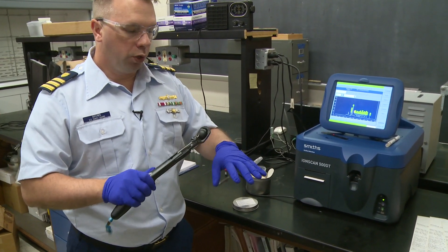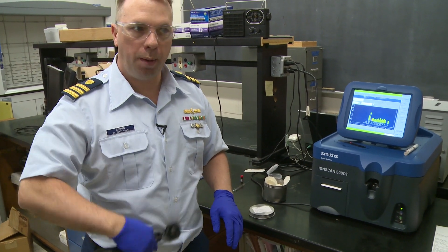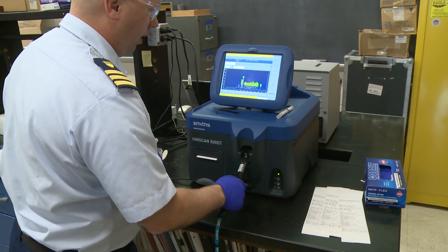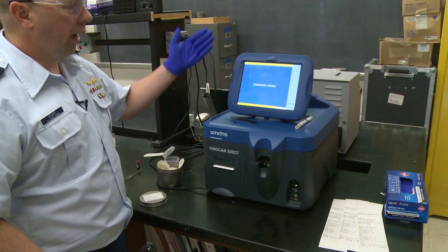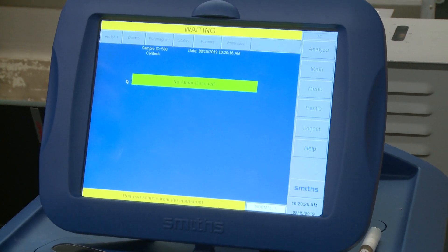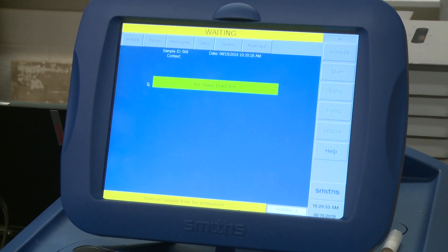When you first go, to prove that I'm not contaminating the instrument, I would swab myself to make sure that I'm not going to pop positive on anything. Is this a clean swab? As soon as you put it in, it automatically analyzes the sample for you. It'll tell you that no alarm was detected, so there was nothing on that swab. So we know I'm not bringing any contamination.